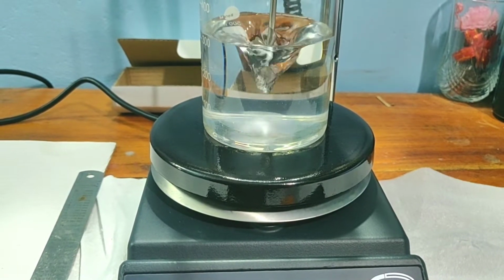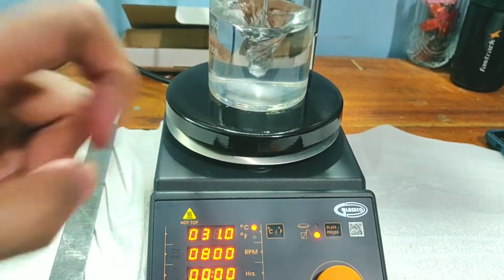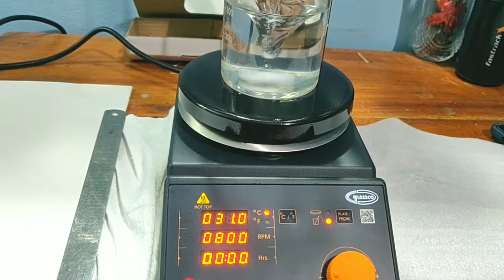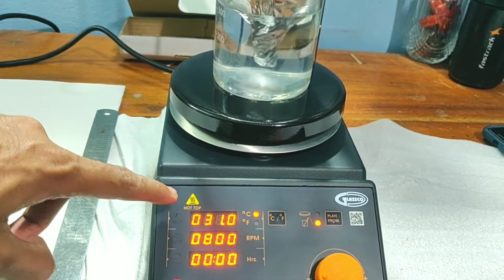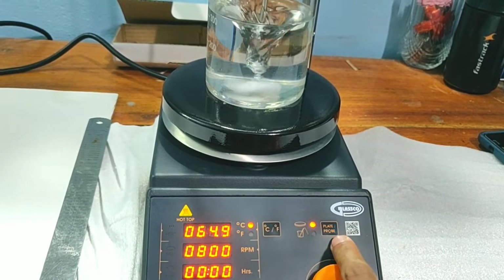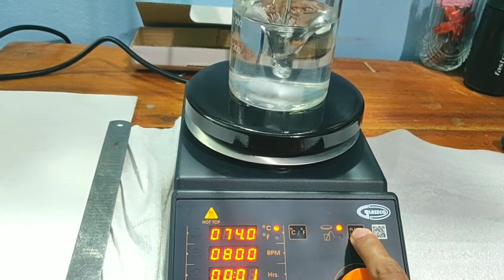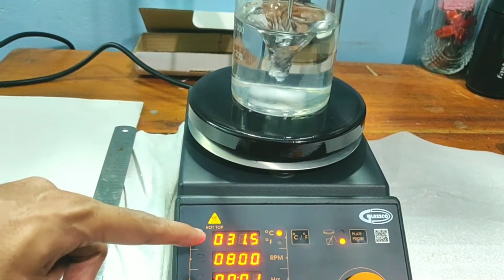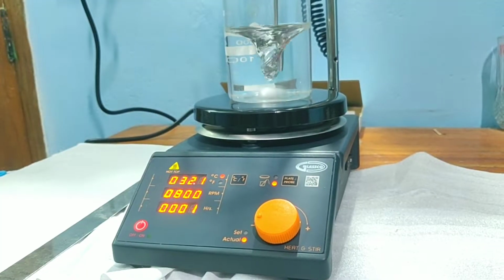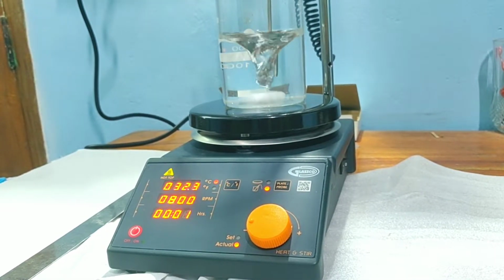You can see the stirring bar stirring very fast and creating a whirlpool in the beaker. The temperature of the probe, that is actually the temperature of the contents of the beaker, is shown here, which is 31 degrees Celsius. You can see a blinking hot top sign which indicates the temperature of the plate is more than 50 degrees Celsius, and the temperature of the plate can be actually seen by clicking that switch on the right side. You can see that the temperature of the plate is pretty fast rising up, and it automatically goes back to the temperature of the probe, which is the actual temperature which we want to measure.